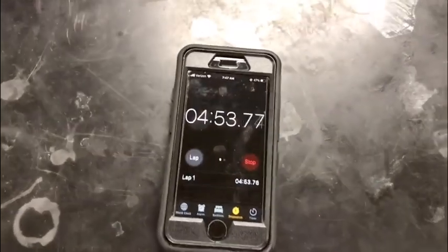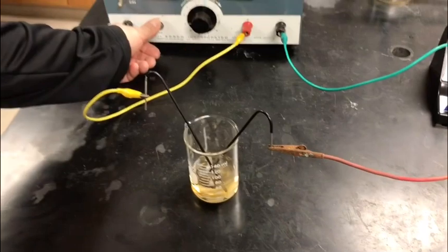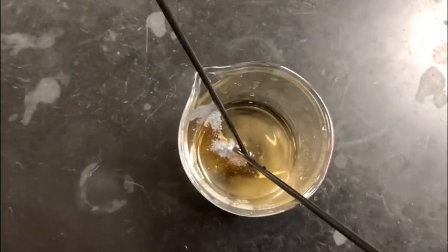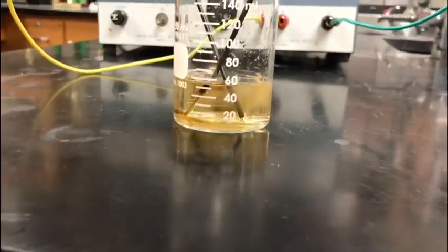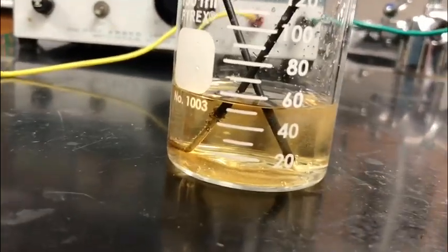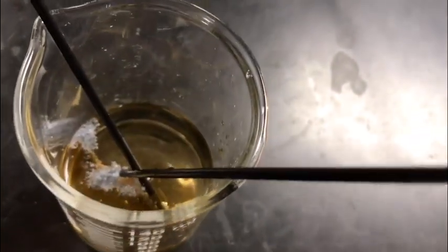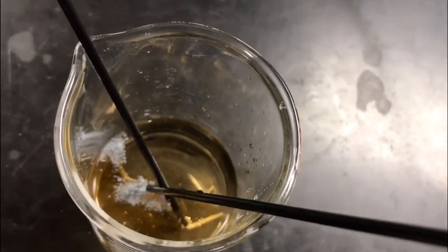Watching the clock — just about time to turn that off. Five minutes. After five minutes, let's see if the solution has changed color — we've got a brown solution. Looking carefully, there is some solid that has collected on the top.